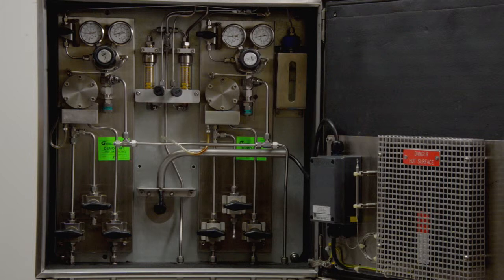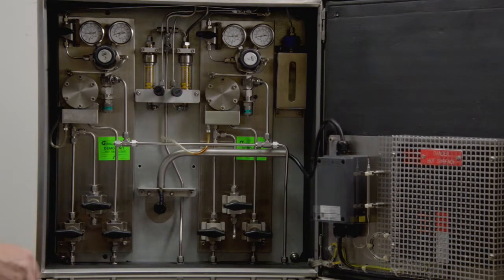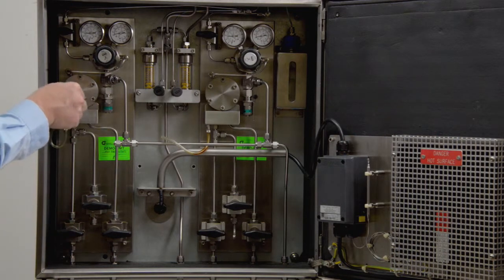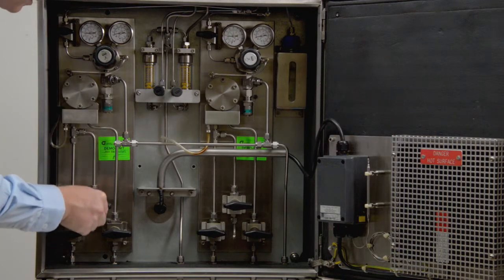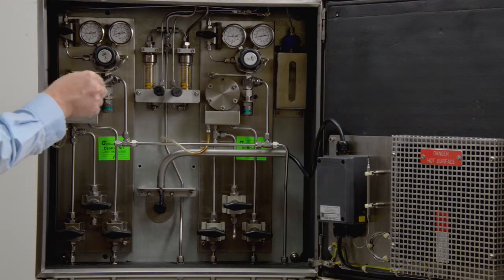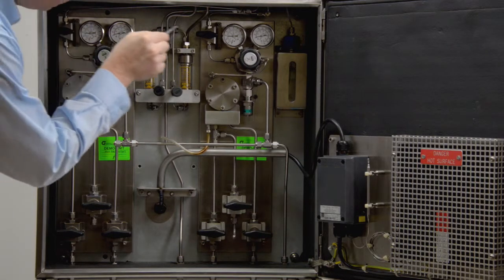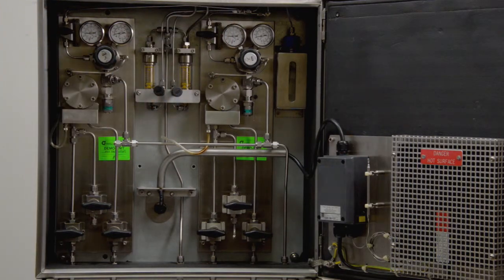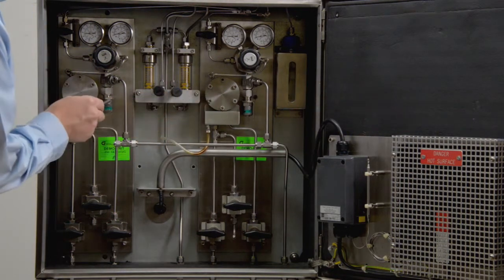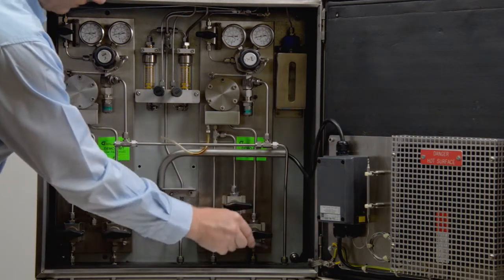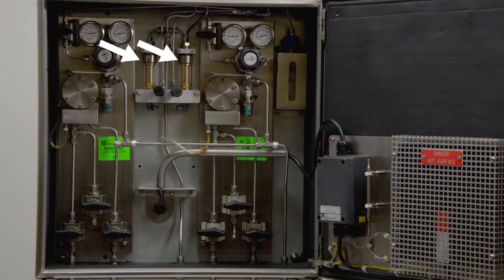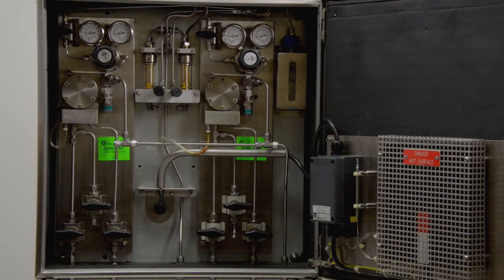A crude oil cabinet is also equipped with a heater to prevent building of waxes and blockage. During the test, the sample passes through a fast sample loop, which contains a self-cleaning bypass filter of small volume. Before entering the measuring cell, a pressure controller regulates the sample pressure. The minimum inlet pressure required is 110 kPa. The pressure relief valve prevents overpressure. The flow can be monitored by the flow indicator. After measuring, the sample leaves the conditioning system at atmospheric pressure.